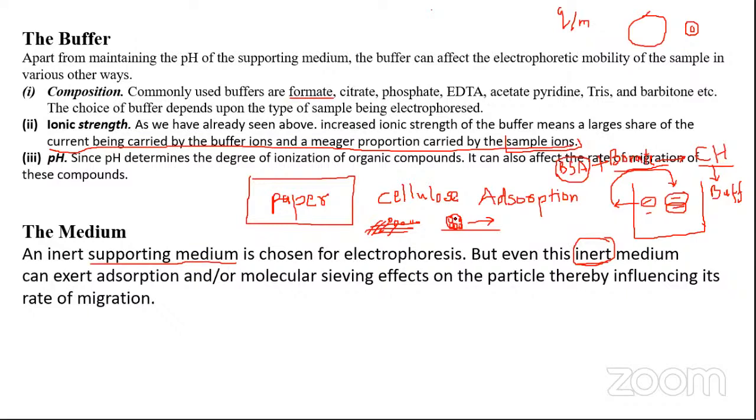Although, because of the charge on the ion, it will be pulled towards one end of the electrophoretic unit, there will be a force dragging that molecule, instead of the molecule moving smoothly all throughout. So there will be more dragging that you will see. When you carry out paper electrophoresis, imagine this is the paper in which I am carrying out electrophoresis. Instead of getting sharp separation bands, what you get is something like a comet with a tail. That is because some molecules are retarded while some molecules continue to move. So will this be of your choice in order to bring about good separation?